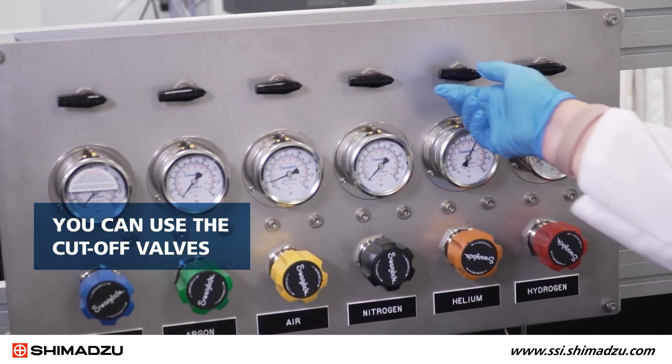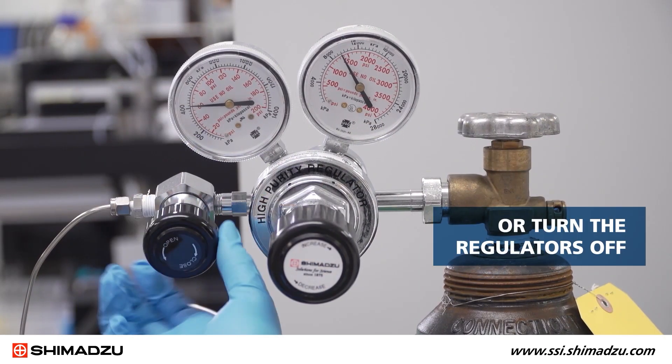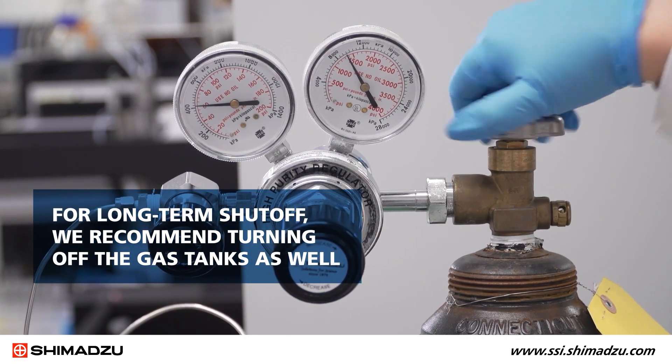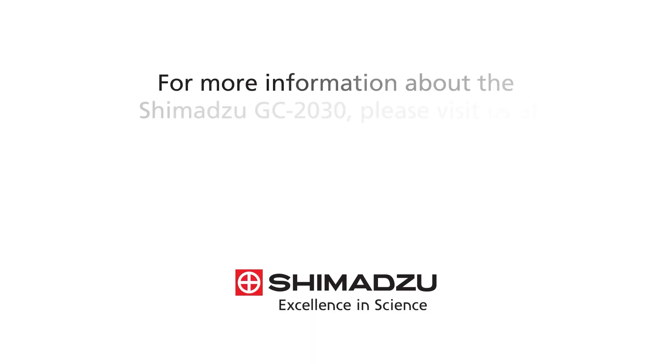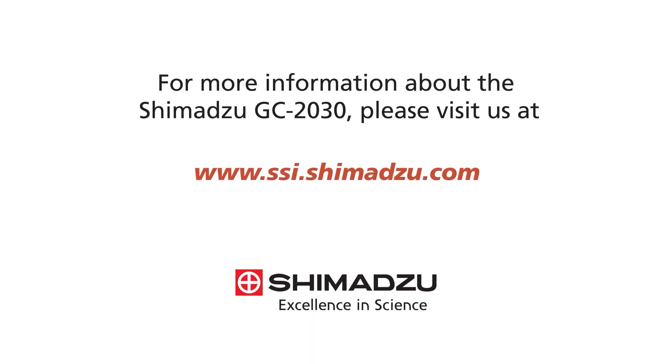You can use the cutoff valves, or turn the regulators off. For long-term shutoff, we recommend turning off the gas tanks as well. For more information about the Shimadzu GC2030, please visit us at www.ssi.shimadzu.com.